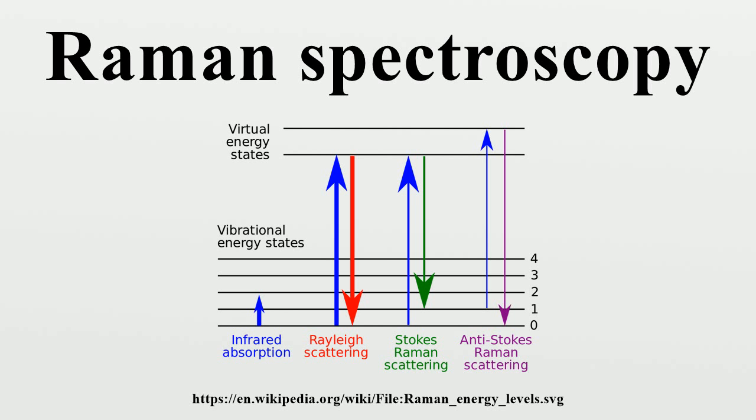The radial breathing mode is a commonly used technique to evaluate the diameter of carbon nanotubes. In nanotechnology, a Raman microscope can be used to analyze nanowires to better understand the composition of the structures. Spatially offset Raman spectroscopy, which is less sensitive to surface layers than conventional Raman, can be used to discover counterfeit drugs without opening their packaging, and for non-invasive monitoring of biological tissue.